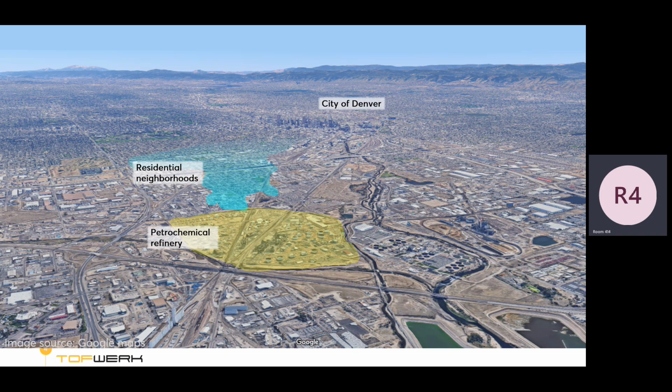That said, we have done ethylene oxide studies. For example, we have a client in Germany, and they know that they have ethylene oxide emitted from certain locations on their facility. So when we drive through and see that chemical formula, we know it's acetaldehyde or ethylene oxide. You can't tell that with the instrument, but logically, it's ethylene oxide.